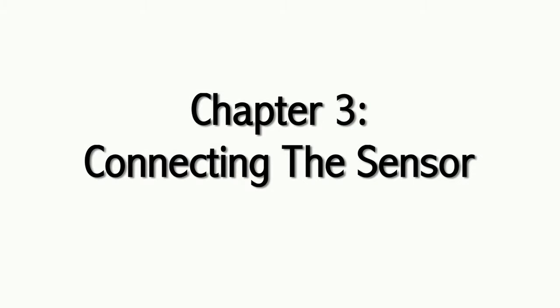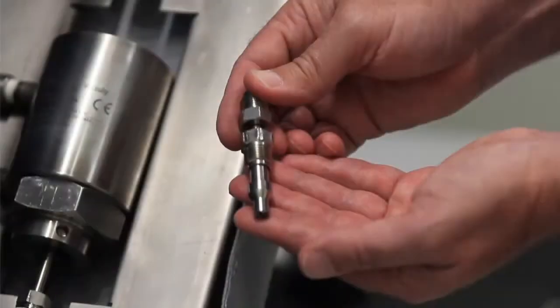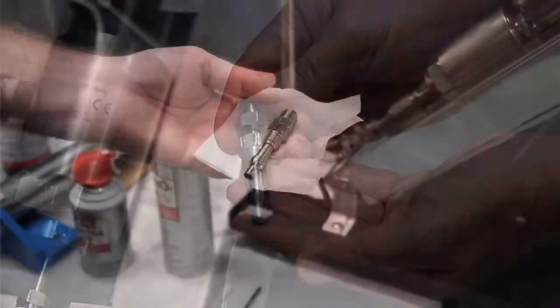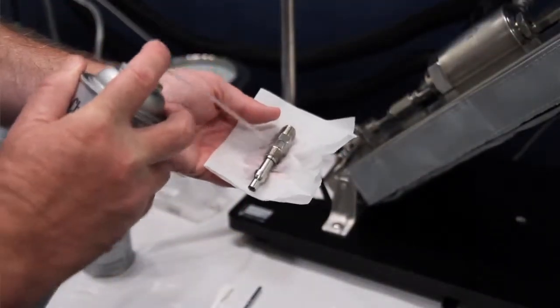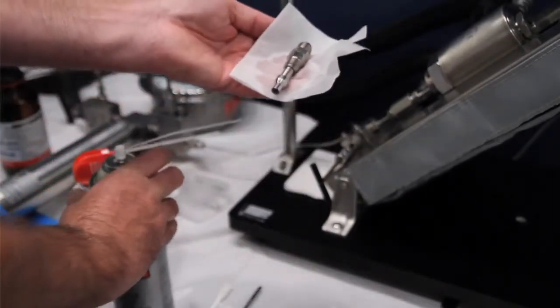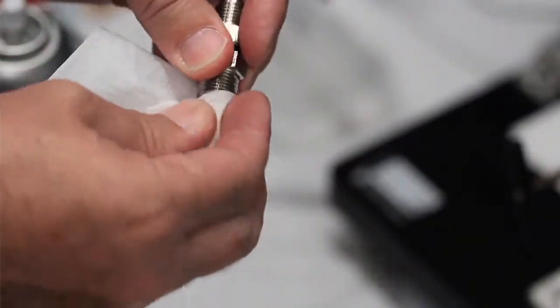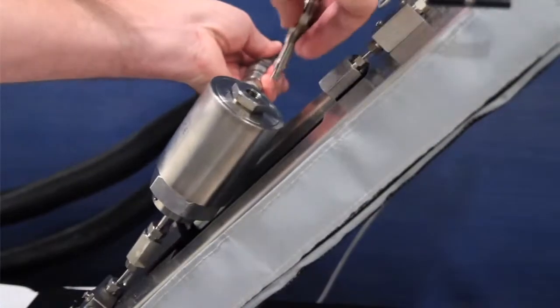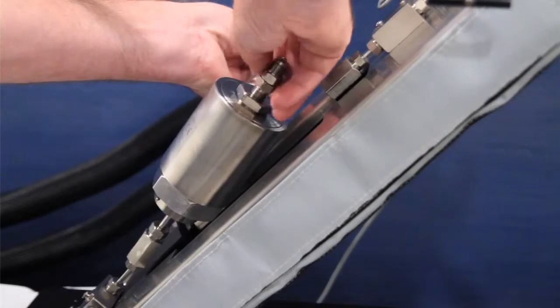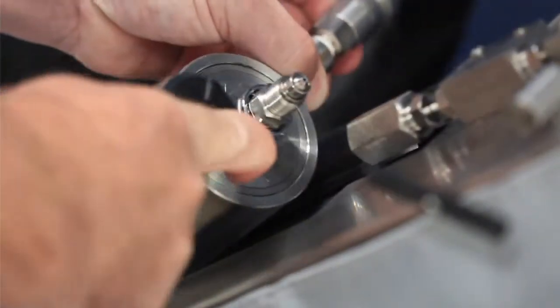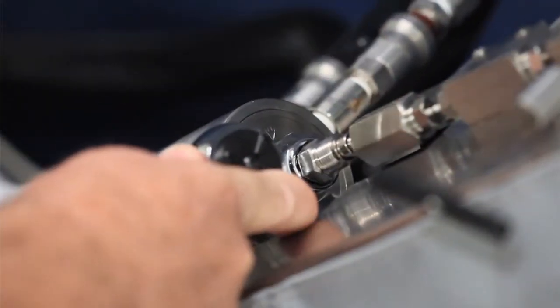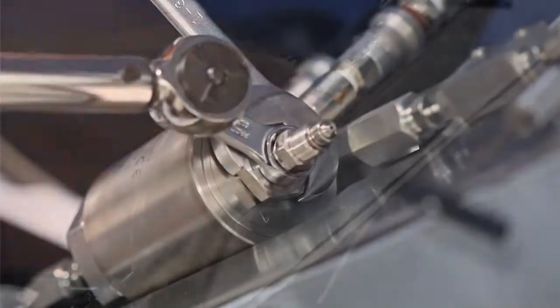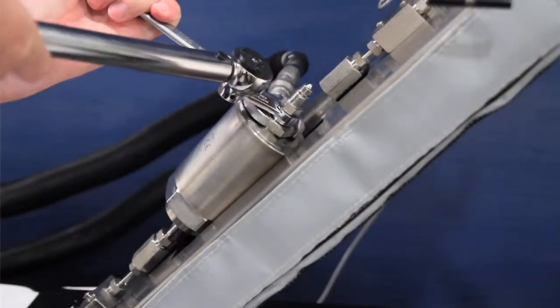We will now show you how to connect the sensor. After the sensor has been cleaned, we will need to clean the low torque exhaust tube. Pick up the low torque nut and clean it with solvent, then dry it with the lint-free kim wipe. Install the low torque exhaust tube back into the hole at the top of the sensor. Place low torque exhaust nut into hole and tighten the nut to the sensor at 65 foot-pounds. You have now installed the low torque exhaust.